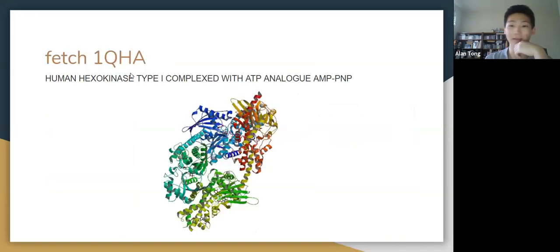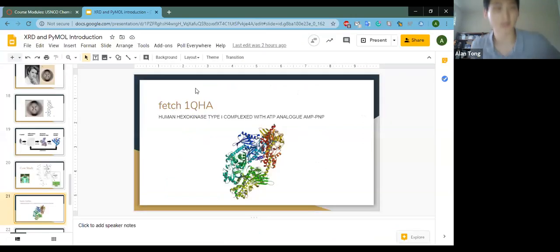All right. Now, let's move on to the second half of the talk, right? We've talked about X-ray diffraction, and we've talked about how we get these structures. Now let's actually look at how we analyze it, right? So first, I'm going to go to PyMOL.